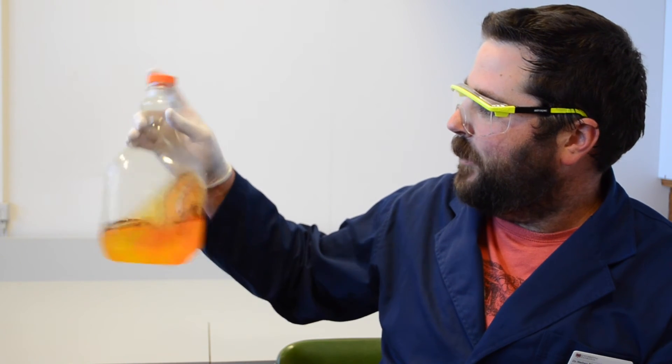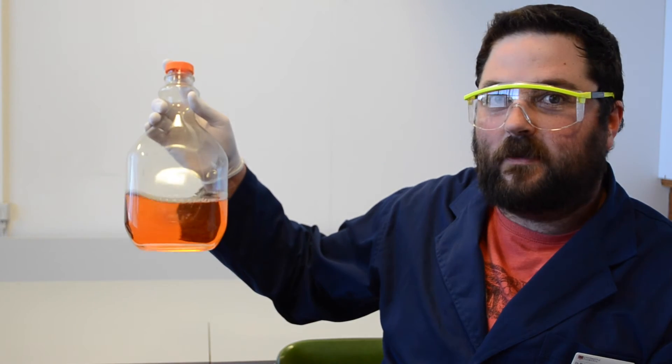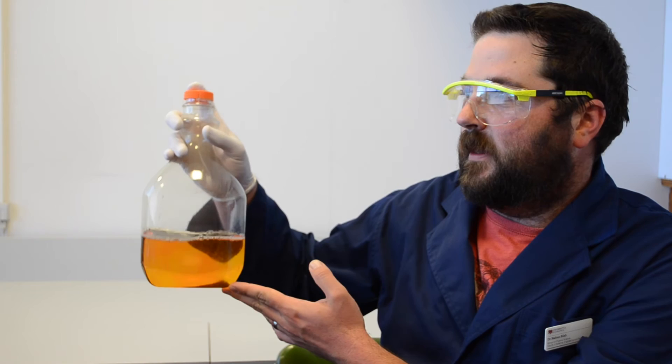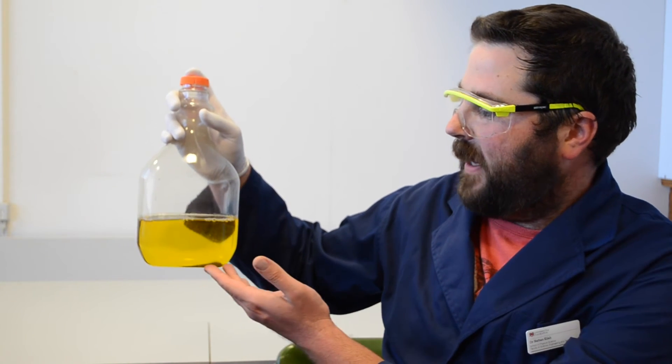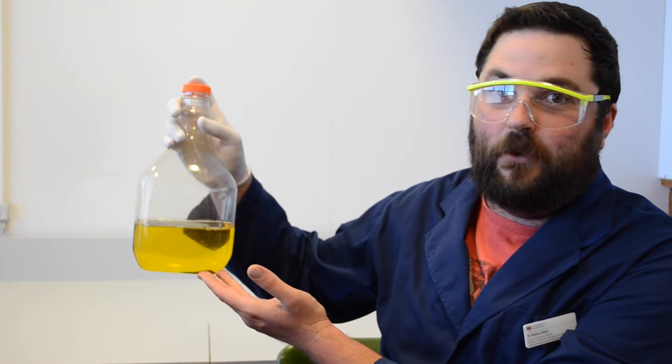When I shake the bottle, I'm oxidizing the indigo carmine to this red form. If I leave it sit, the glucose acts on the dye to return it back to the reduced or yellow form.